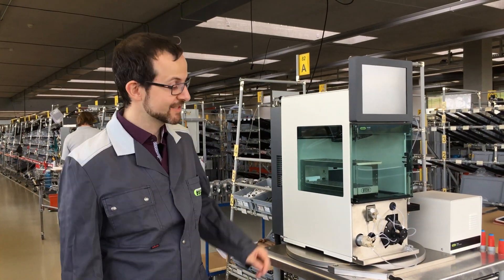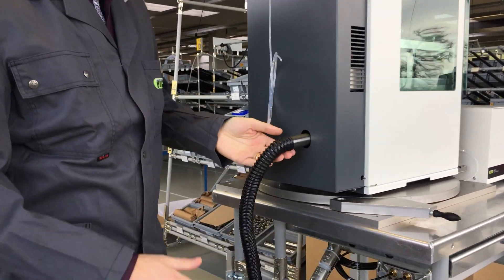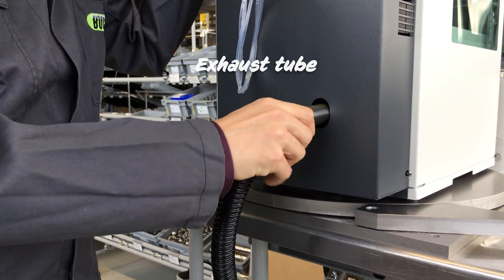First, check the exhaust tube on the back of the instrument. It can happen that the exhaust gets disconnected by accident, so press it on tightly and make sure it's fully connected.